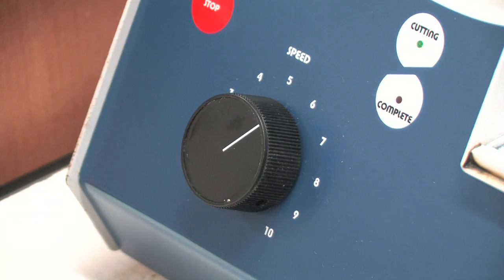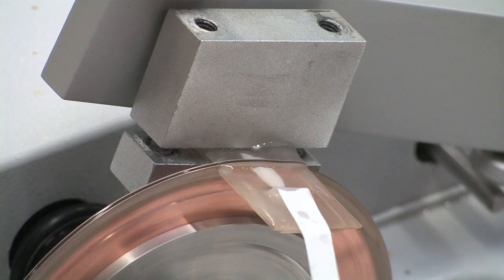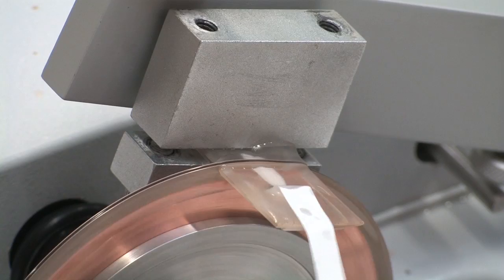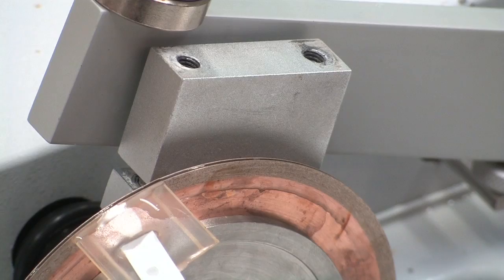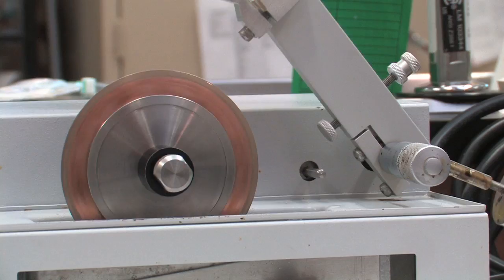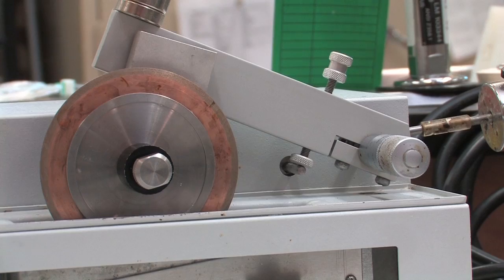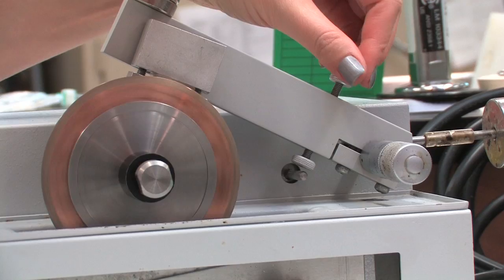When the saw is almost finished cutting, slow the speed down to about 3 and turn off the saw just before the blades finish cutting through the sample. If need be, you can finish the cut with a scalpel. Another option is to use the automatic stopping device located on the cutting arm of the saw. This can be positioned to stop the saw just before it cuts completely through the sample. Adjust the screw on the arm so that it depresses the stop switch when the blade has just barely finished cutting through the sample or nearly through.